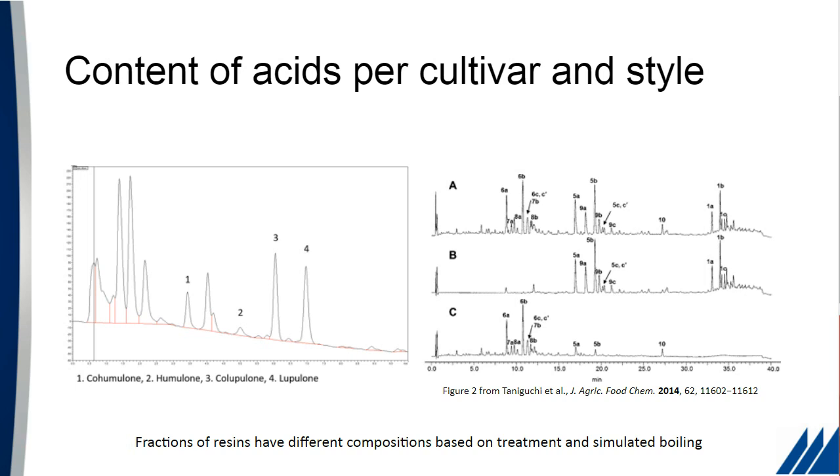And then when we start comparing our data to the prior literature, that also gets difficult. And one of the big reasons is that we now have better instrumentation. So this includes our pumps, our columns, our tubing, everything, even when we're trying to compare LC data to LC data. So you can see there's a lot of analytical work left. Calibrations, internal standards, standard addition experiments, things like that, to make sure that we get the data correct.